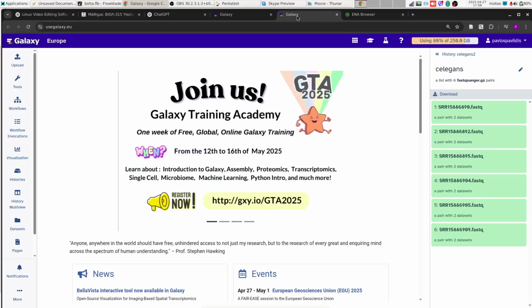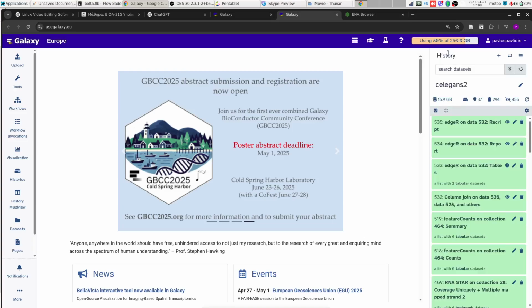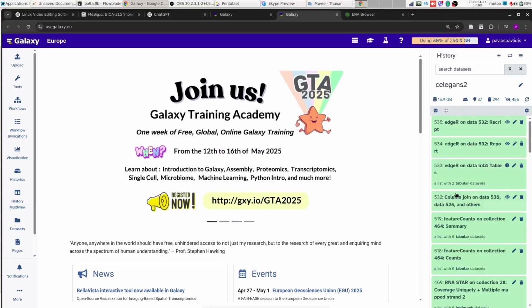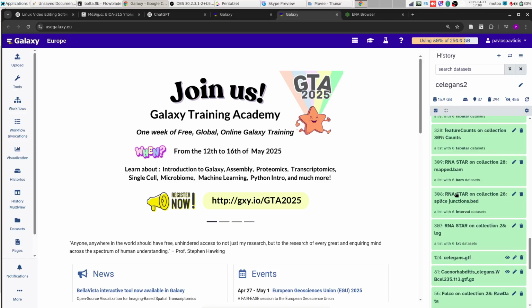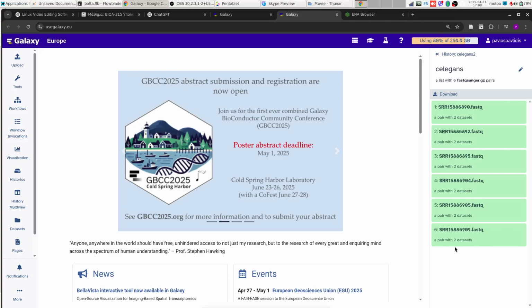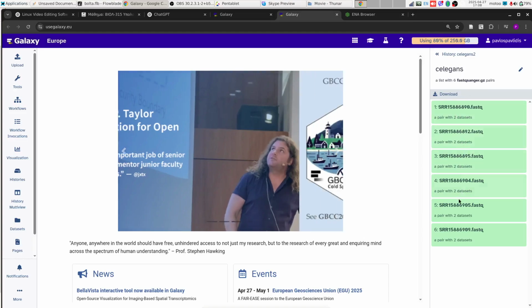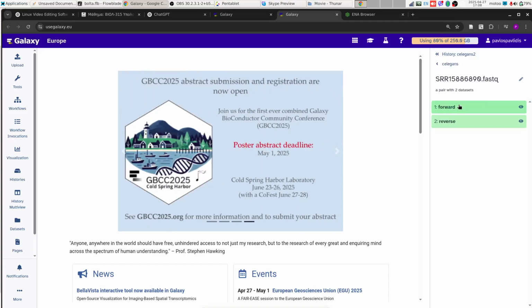We have done it many times in the past, so I will not show this again. Okay. I have loaded the data and after I loaded them, I put them in a collection. So this is a dataset collection, a paired dataset collection actually, as you see here.